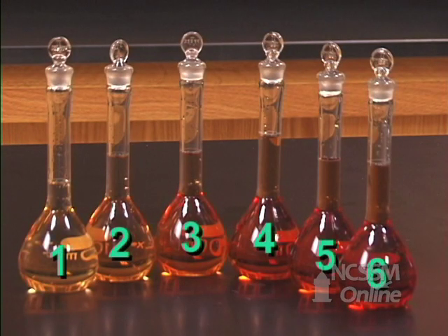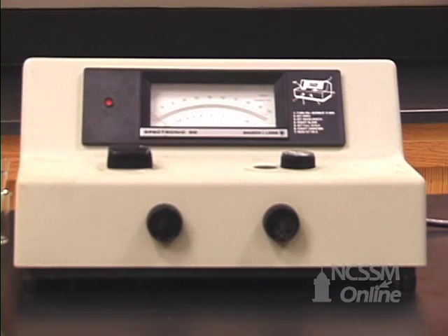We have prepared a series of solutions of known concentrations of the complex ion. We will use a spectrophotometer to read the absorbance of those solutions. We will make a Beer's Law plot of absorbance versus concentration to make a calibration line.